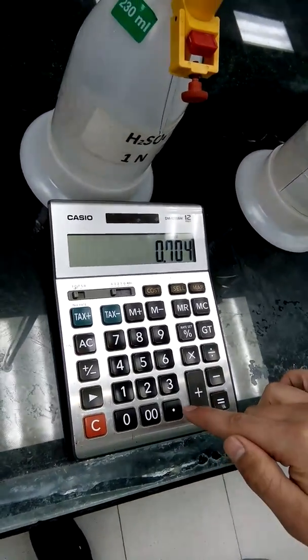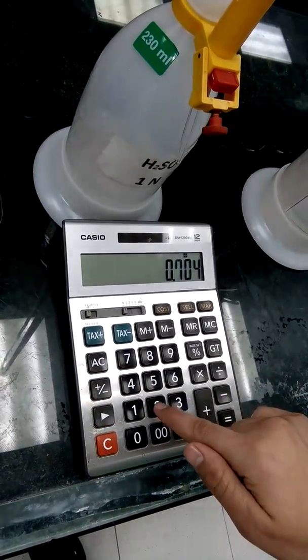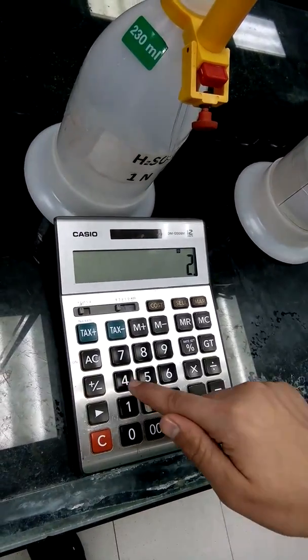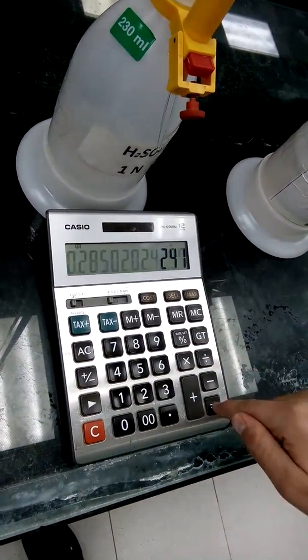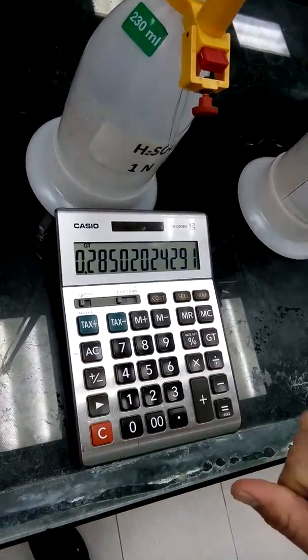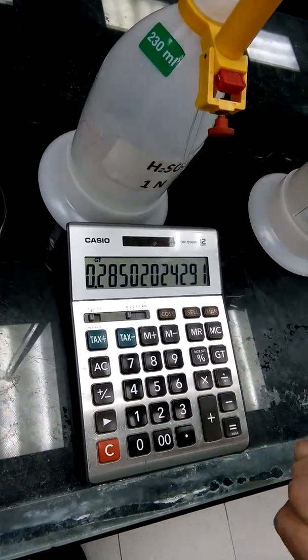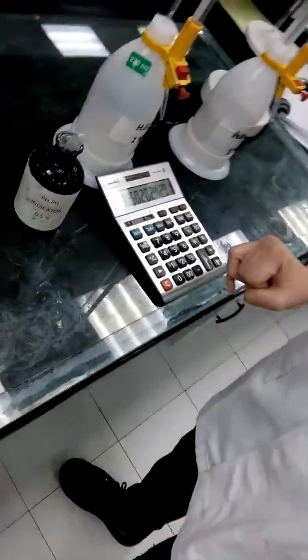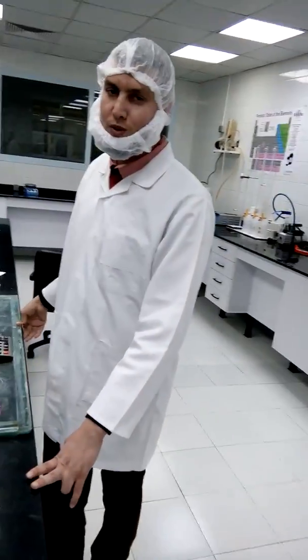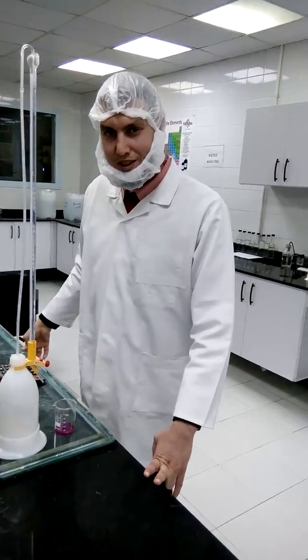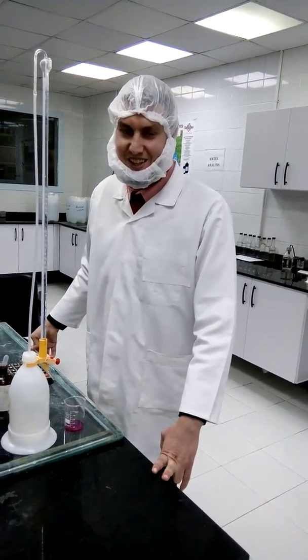Divided by the weight of the sample, which was 2.47, equals 0.28. So today we learned how to determine acidity in juices. Thank you.